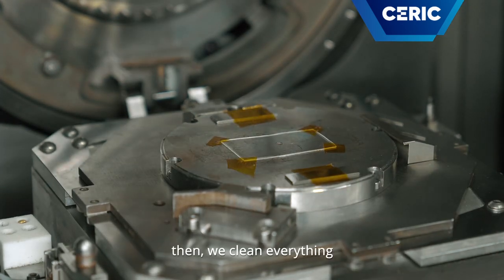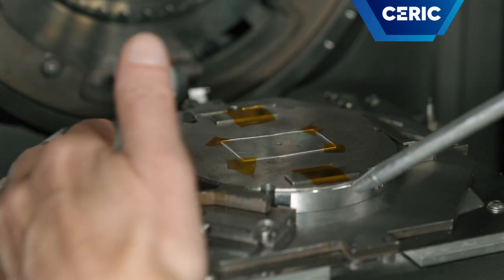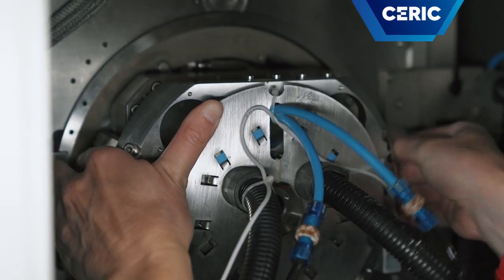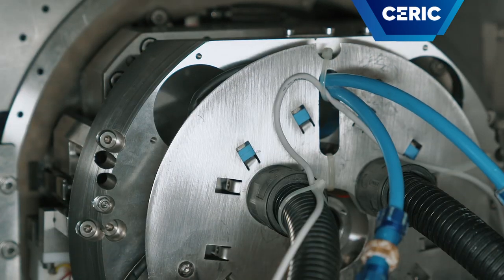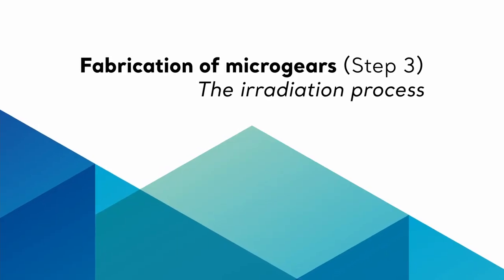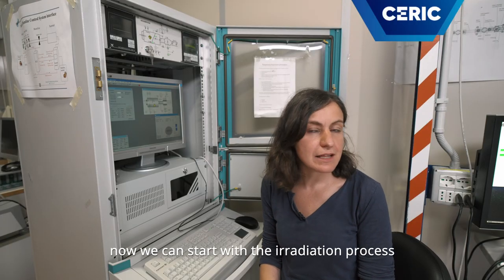Then we clean everything just to be sure. And then we can close the sample on the mask. Now we are ready for the exposure and we close this chamber. Now we can start with the irradiation process.